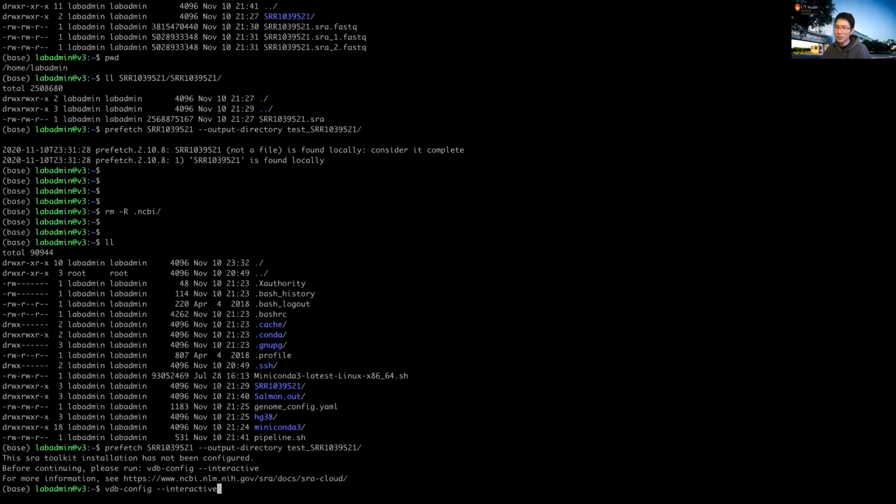Yeah. So remember, we already pre-installed the prefetch for you. If you install the prefetch the first time and you want to use it for the first time, then you need to do the configuration. So this is how you do the configuration. You just simply copy this one and type it in.